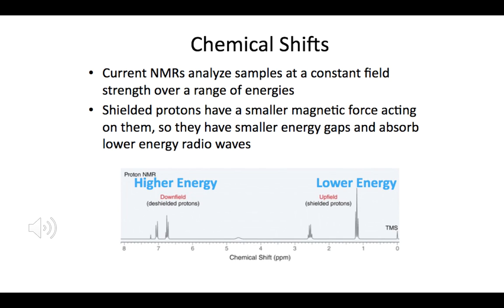Alkanes, which are the most shielded, would be around 1 to 2, pretty low. And then if you have a carbon, hydrogen, and a Z bond, a Z could be a halogen or a benzene, etc. So I would say memorize those types of hydrogens that are bound to it.